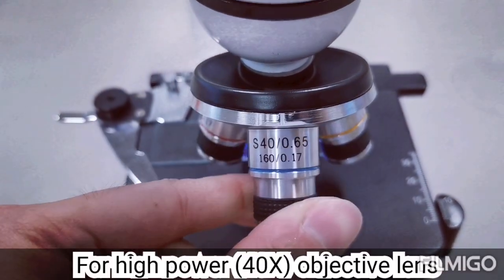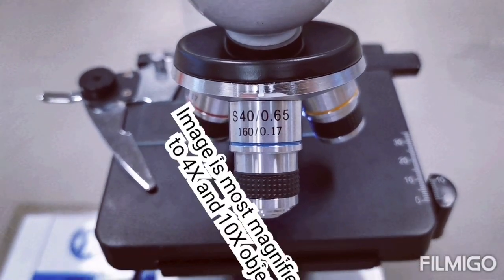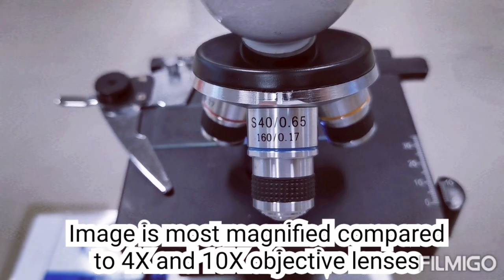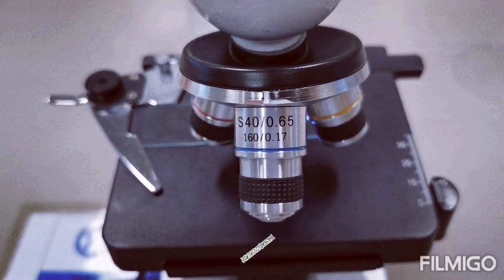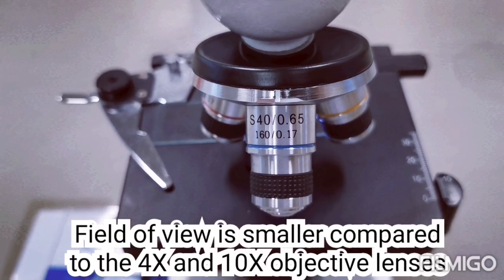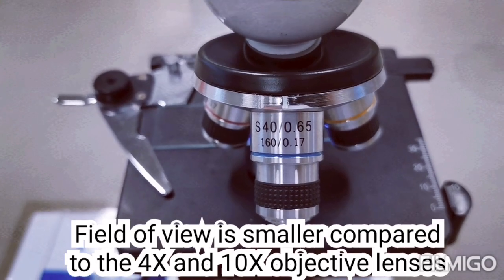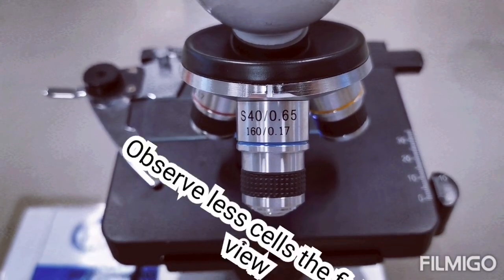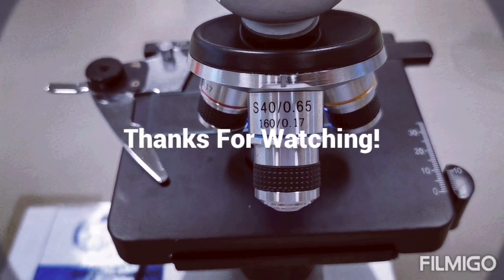Lastly, for the high power objective lens, or the 40 times objective lens, the image is most magnified and is very large compared to the other 2 objective lenses. However, the field of view now is much smaller as the object has now been magnified more, and so the image is much more zoomed in than before, and you can observe less cells as compared to the images under the other 2 objective lenses.